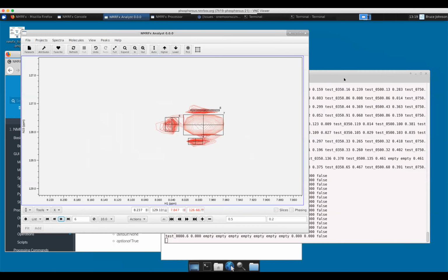If you like the look of that titration, you can click fit, explicitly fit, get error parameters. And there's a lot of subjectivity in here. One is deciding which peaks to include and which peaks not to include in a titration. Right. Basically, once you've fitted and it looks like the errors are reasonable, then you'll add it, and basically then you're saving that fitted peak. Okay, I see. And then after you've added multiple to the table, you can do the global fit where you have a single KD to multiple titrating peaks. So that's the workflow. Okay.